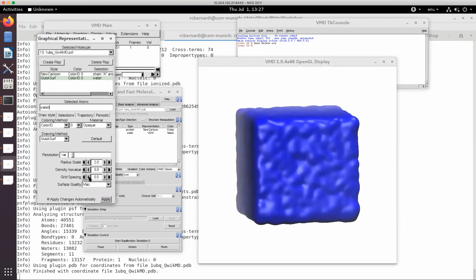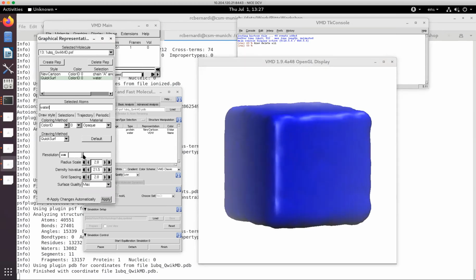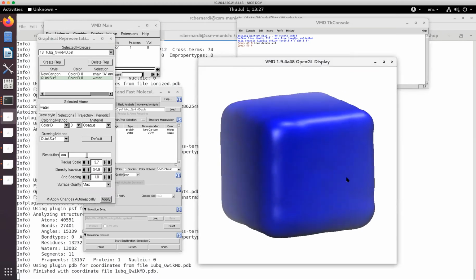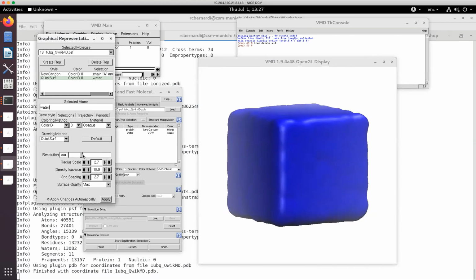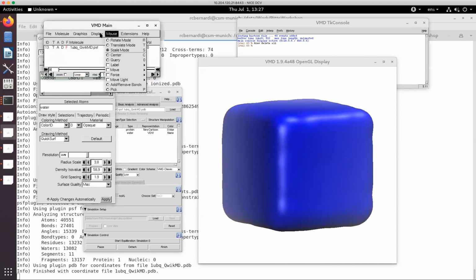And then if you use the resolution, the radius scaling is what'll make it smoother overall. That's a good way of making it smooth. So you can decide how bumpy it looks. And you might ask, well, why do you care, right? And the answer is when you choose this glass bubble material, for example, you'll see that how bumpy it is has a big effect on how much of its silhouette you see when it gets rendered.